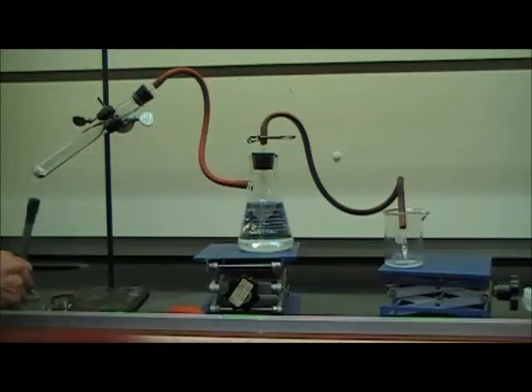So I'm simply going to start heating the test tube very gently here, and it'll take a few minutes to get hot enough, but pretty soon what you will see, and I don't know if you'll see it on the video or not, but you'll see that the potassium chlorate in the test tube actually starts to bubble, which will seem strange because it's a solid, have a kind of solid bubble, but it does. It's kind of interesting how that happens.